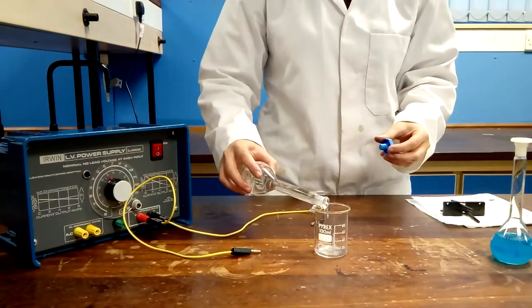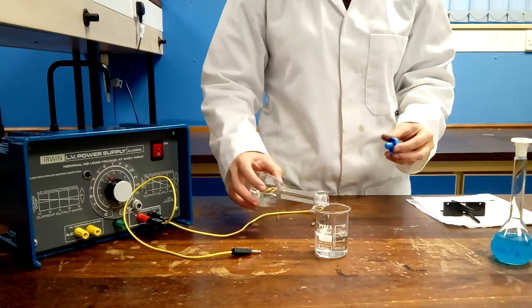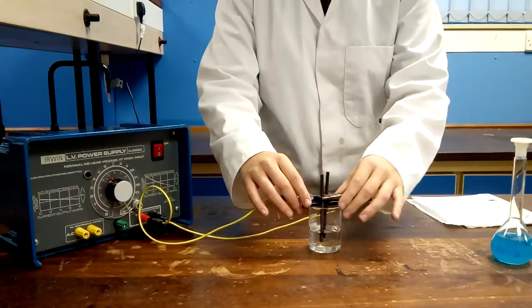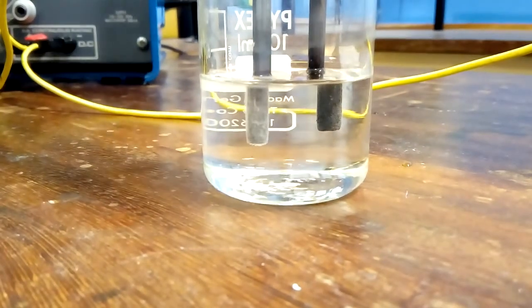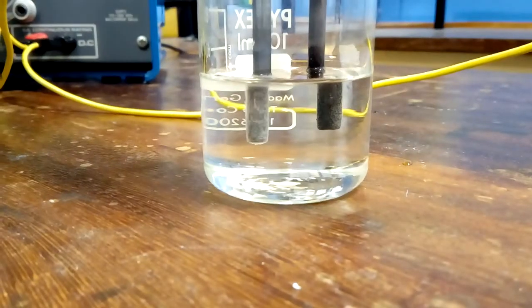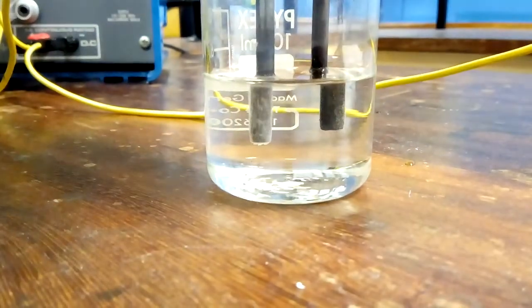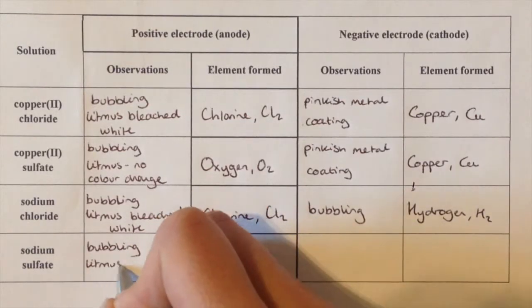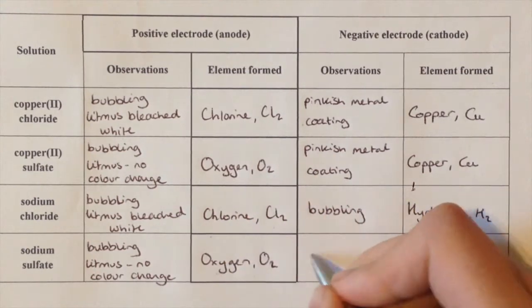Finally, observe the last salt solution of sodium sulfate. Bubbles are produced at both electrodes again. When testing the anode with litmus paper, the paper remains blue. There is also gas produced at the cathode, and no metal deposit seen. Complete the table with observations from your last salt solution.